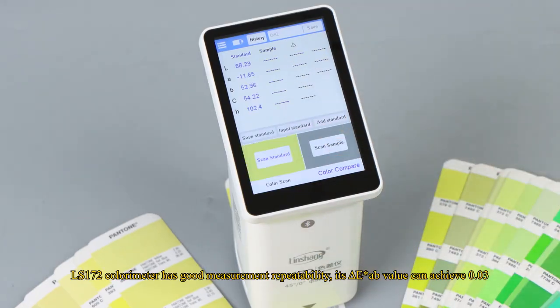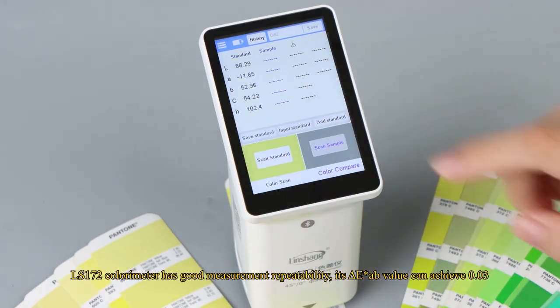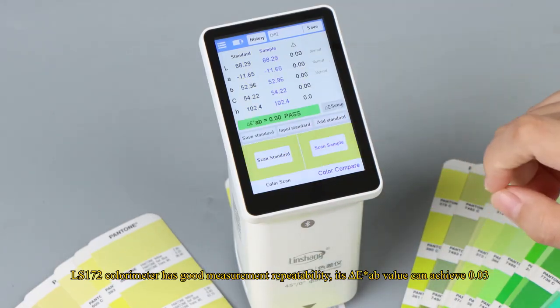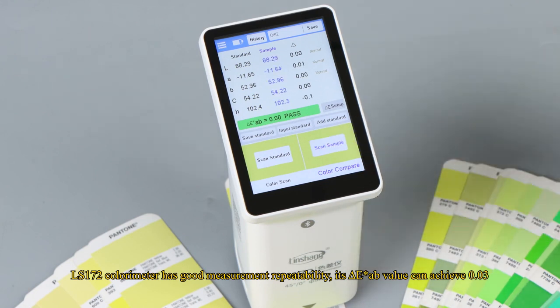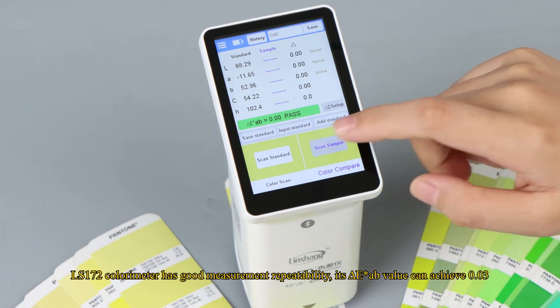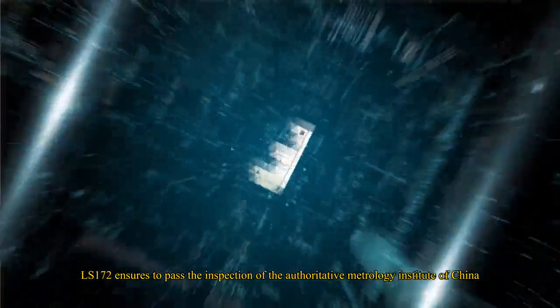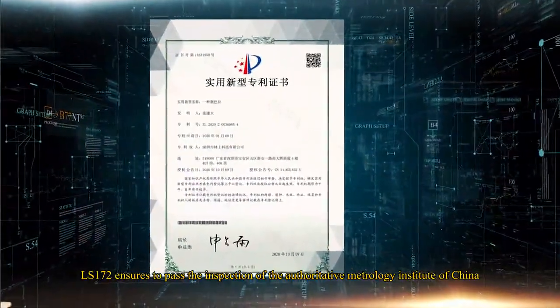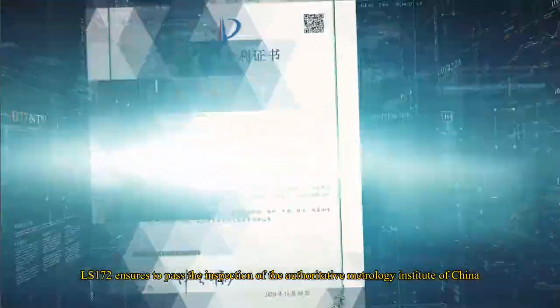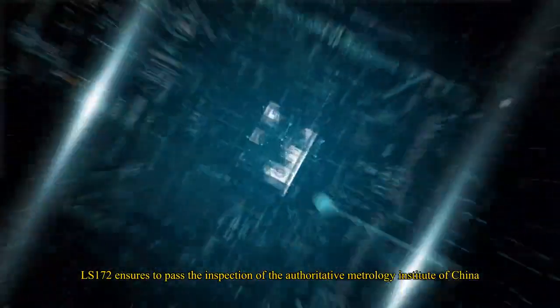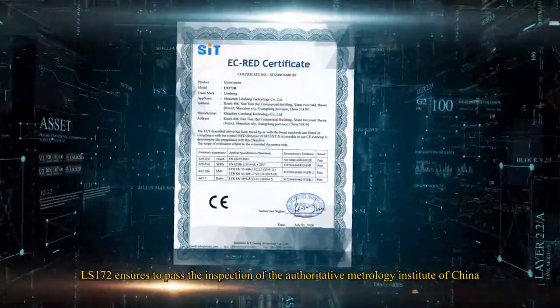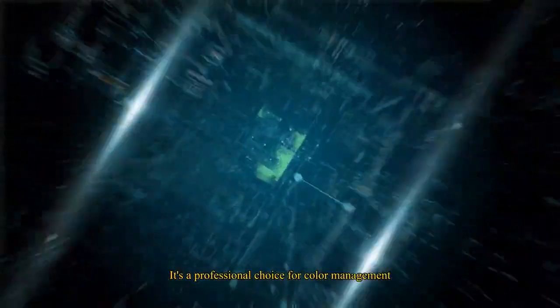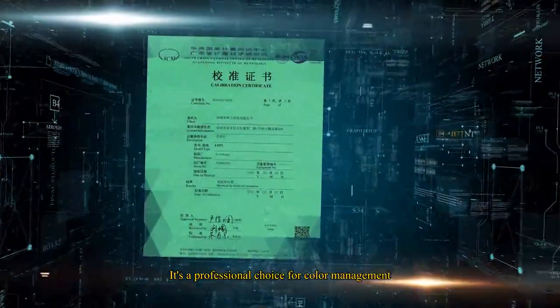LS172 colorimeter has good measurement repeatability. Its delta E asterisk AB value can achieve 0.03. LS172 ensures to pass the inspection of the authoritative metrology institute of China. It's a professional choice for color management.